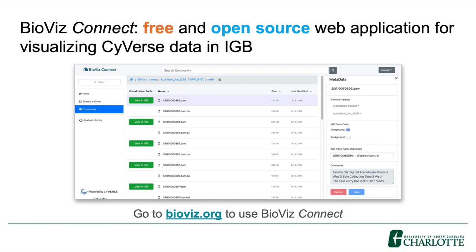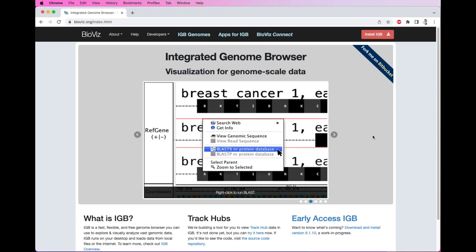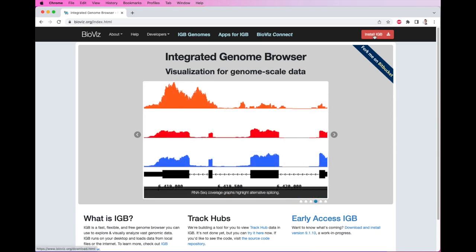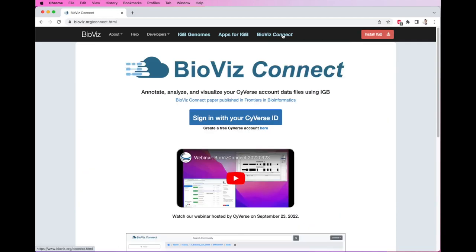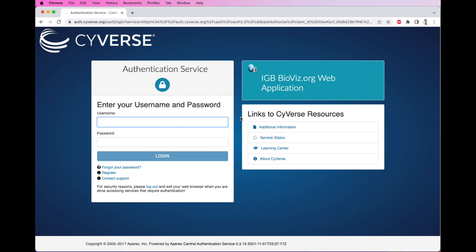Let's go ahead and view a demo of how BioViz Connect could be used. The data in the demo are available for everyone to try, so please check out our website and try for yourself. This is our website, BioViz.org. If you would like to install IGB, click the Install IGB button. To access BioViz Connect, click on the link here. Then click on the Sign in with your CyVerse ID button. To log into BioViz Connect, you will use your CyVerse username and password, similar to other single sign-in providers such as using a Gmail account to log into a website.